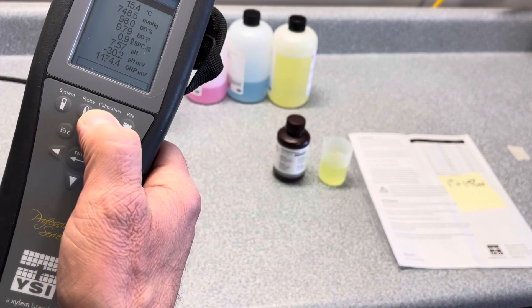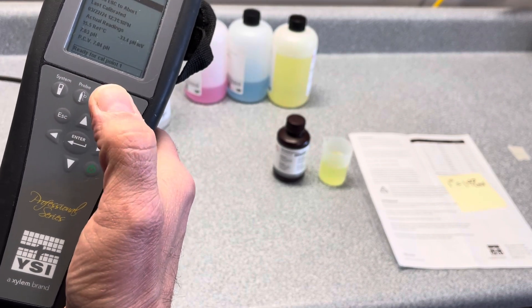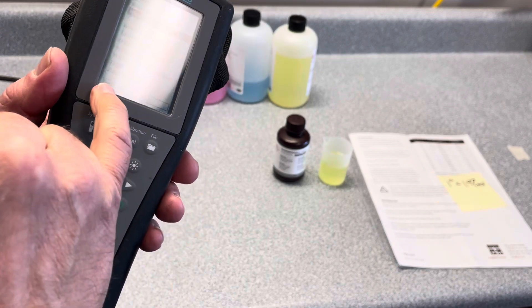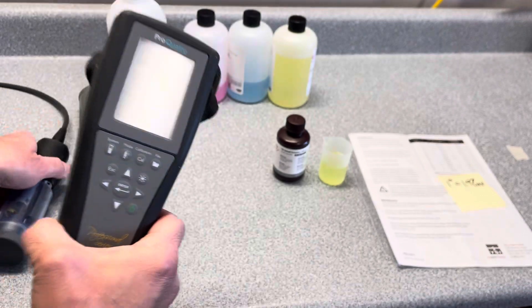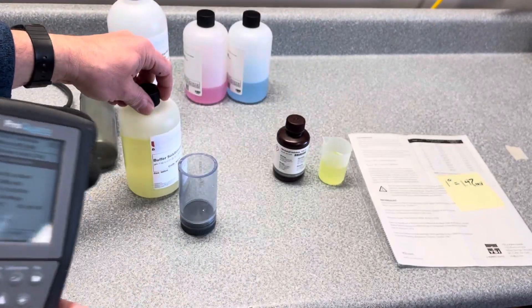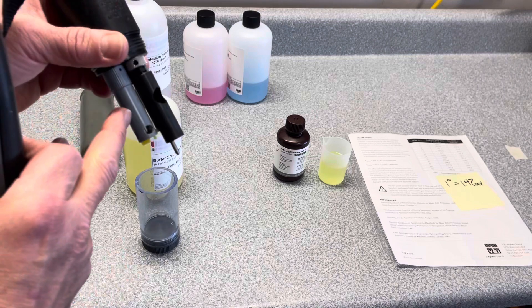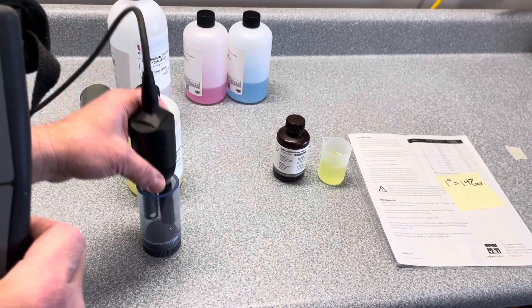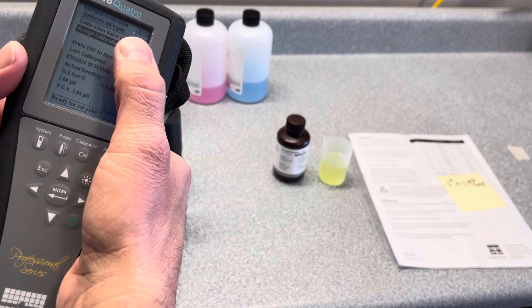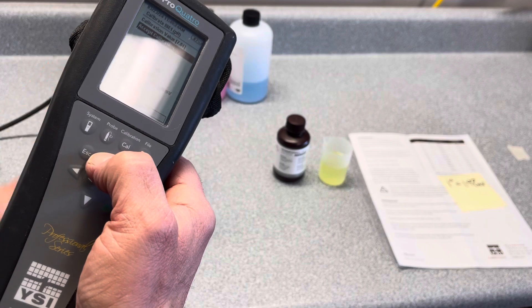Hit escape and go to our next option for calibrating pH. Go down to pH and hit enter. This is the calibration screen for pH — you can see it says 'ready for cal.1.' We would use our clean calibration vessel and start with pH 7. Fill it up about halfway so it gets above your sensor, let it sit until it stabilizes, then make sure the calibration value matches. Toggle up to where it says calibration value and enter what's on the bottle — in this case, 7.00.